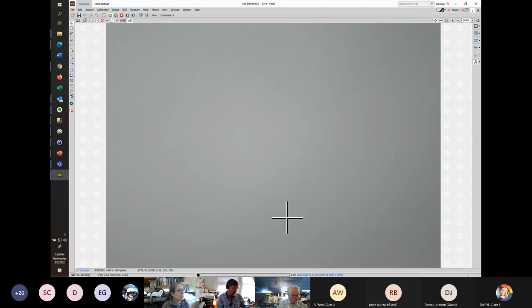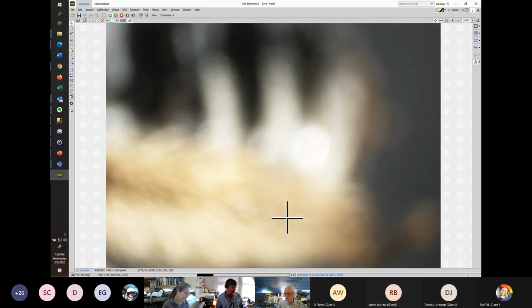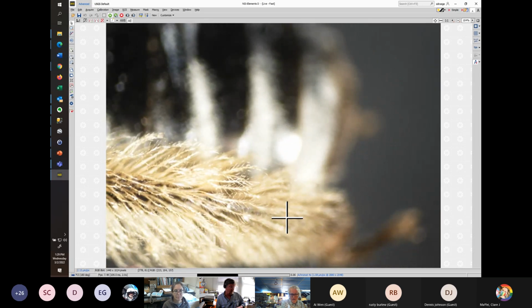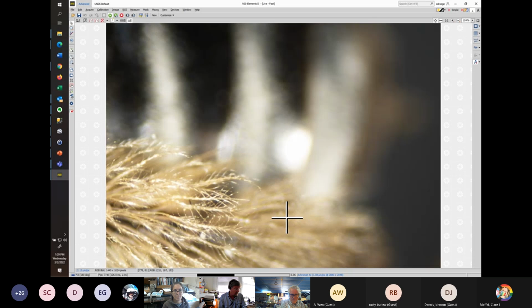And then let's see if I can get a shot of the infamous S-shaped. I find that if I don't have other specimens around, or I can't see because pollen is in the scopal hairs, that I have a hard time telling this from subillatus and illatus sometimes.